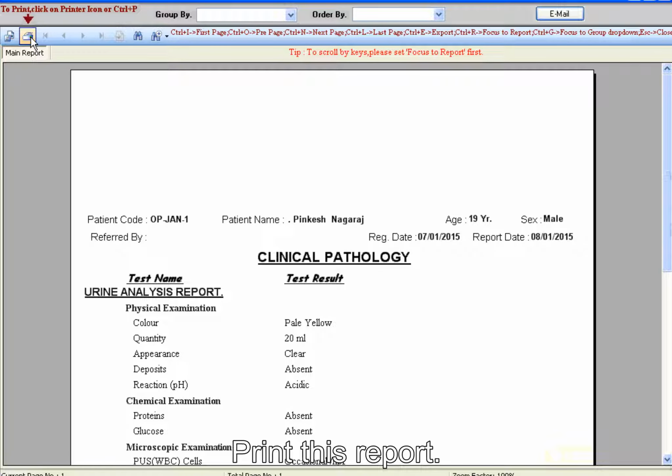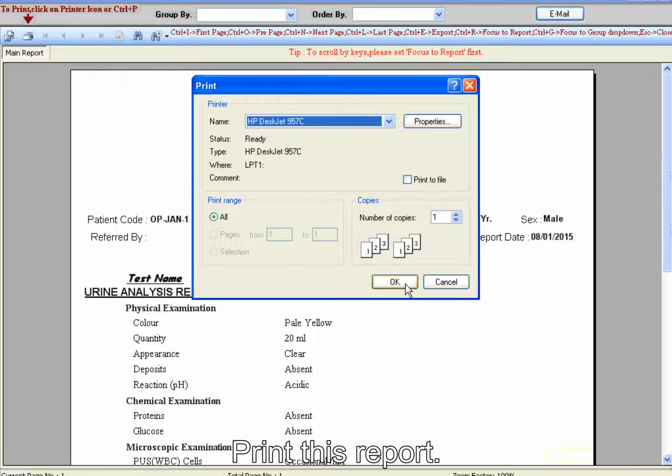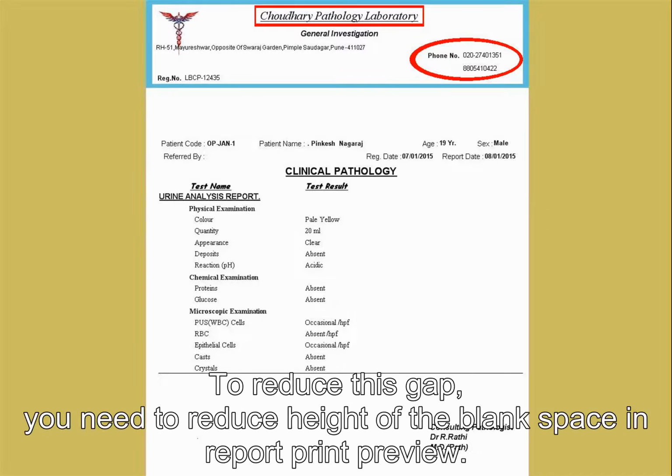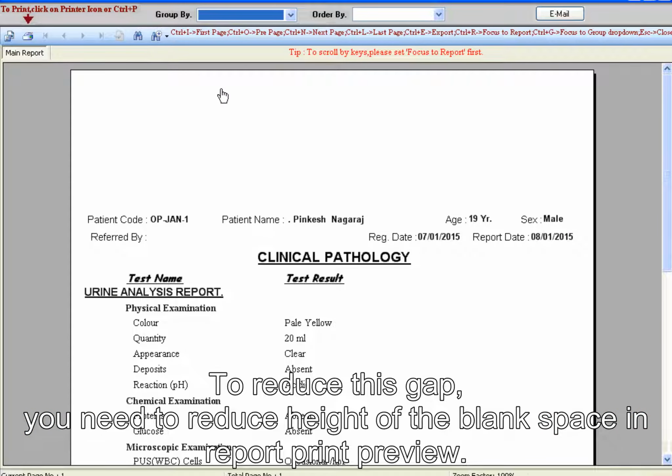Print this report. In printed report on letterhead, you can see gap between already printed material of letterhead and patient details. To reduce this gap, you need to reduce height of the blank space in report print preview.